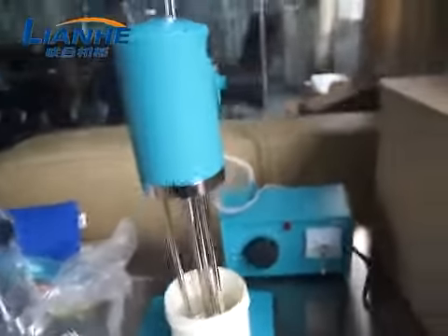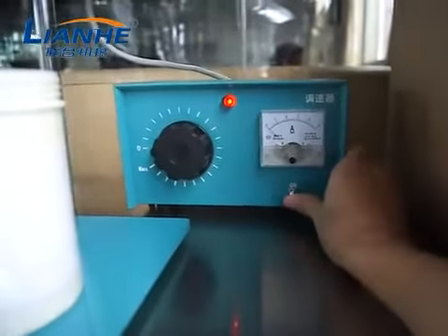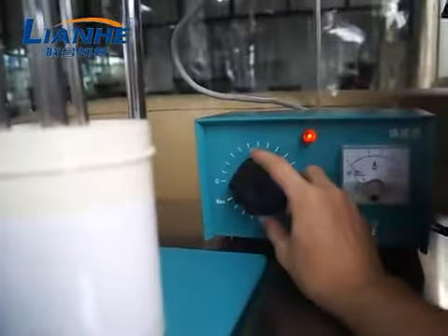Okay, now we are going to test it. First, turn on the switch. Then we can adjust the speed here.